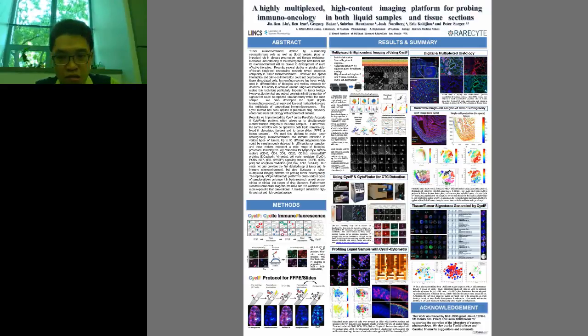And you can also go through just one tumor type. In here we go through just pancreatic cancer at different stages. The thing we found is that in the early stage of pancreatic cancer, the samples are closer to their original normal tissue, that's the pancreatic tissue. But in the late stage you start to see this kind of fuzzy phenotype that we call the heterogeneity of the tumor. So now it's not just far away from their original tissue, they are also more diverse from themselves.